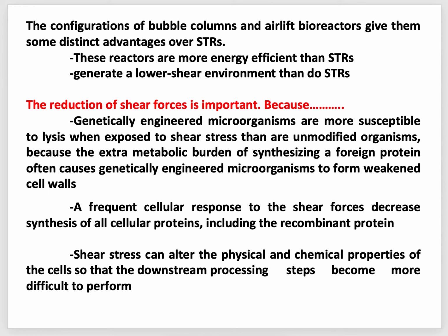Because in the case of STRs, mechanical stirrers are used, and mechanical stirrers need energy. Also, in bubble column and air-lift bioreactors, the shear force is low. Low shear force is more comfortable for the cells that are used as biocatalysts in the bioreactors. So why is low shear force better? Why is it important that we reduce the shear forces?